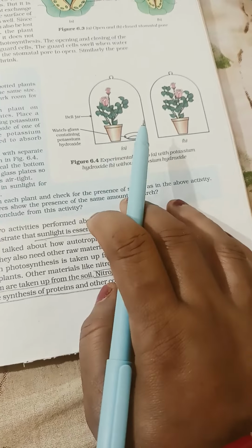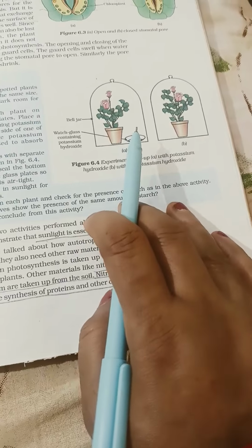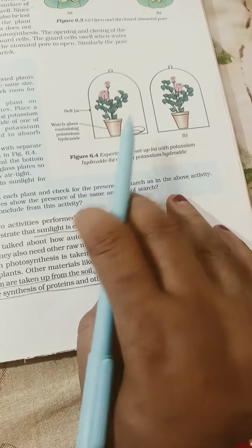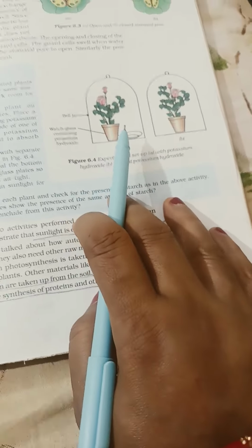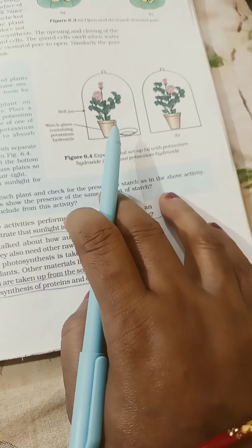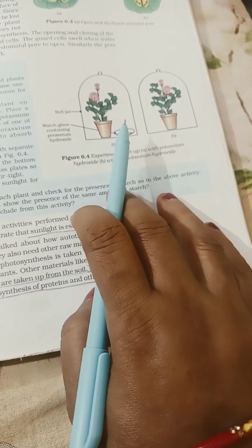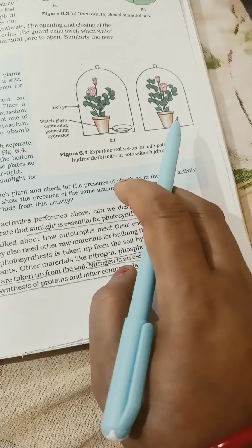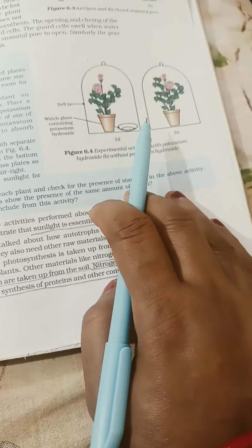Now, if we have to test the presence of starch, we can take the 2 leaves and undergo the iodine test. When we use iodine solution, this leaf will not turn blue-black in color because no starch was made. As there was no carbon dioxide, no photosynthesis takes place, and that's why no starch was made. But this will show the blue-black color. We can say that carbon dioxide is necessary for the process of photosynthesis.